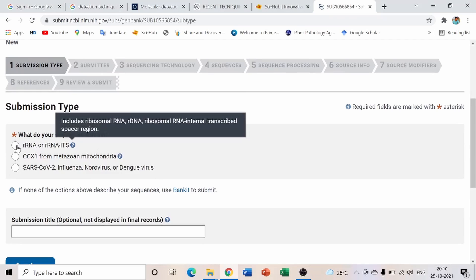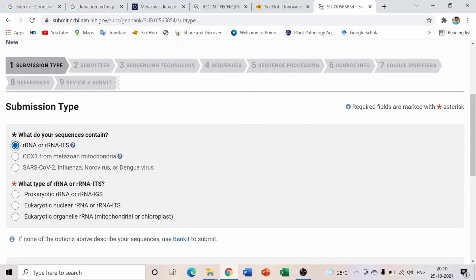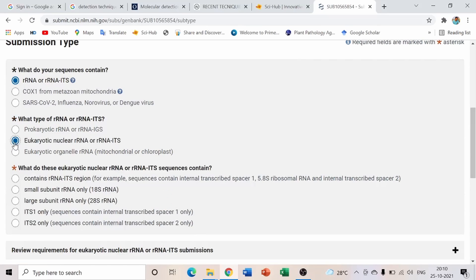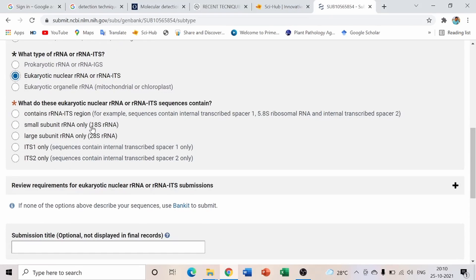The first step is Submission Type. For fungal cultures, the sequence content is rRNA using ITS primers. Since fungi are eukaryotes, select 'Eukaryotic nuclear rRNA or RNA ITS.' Then select the first option — 'Contains ITS regions' — and click it.